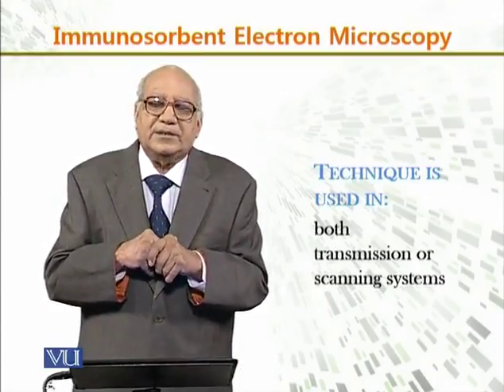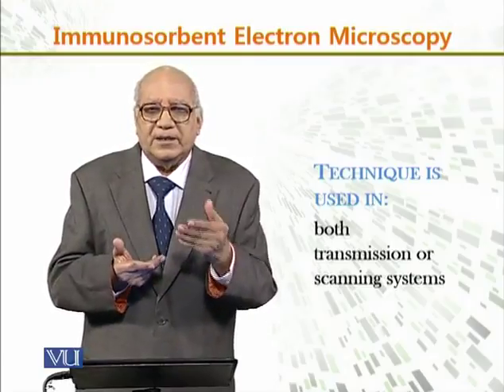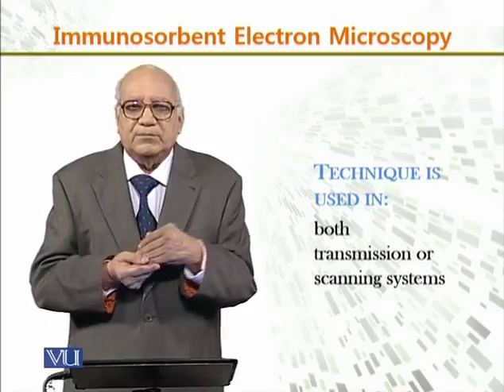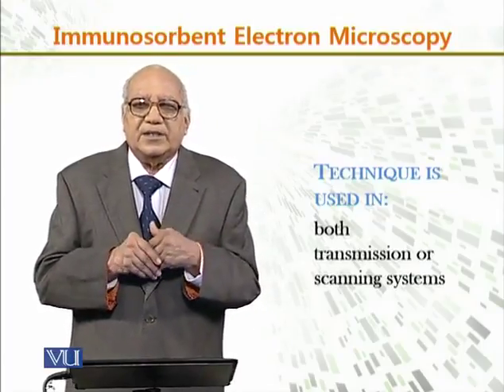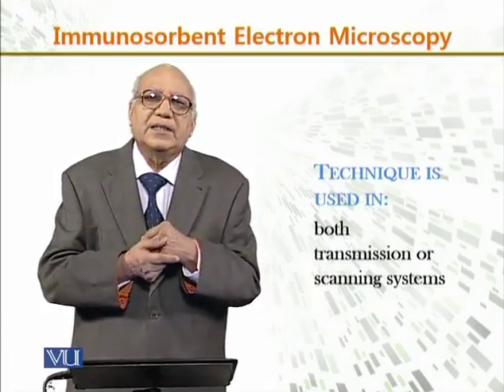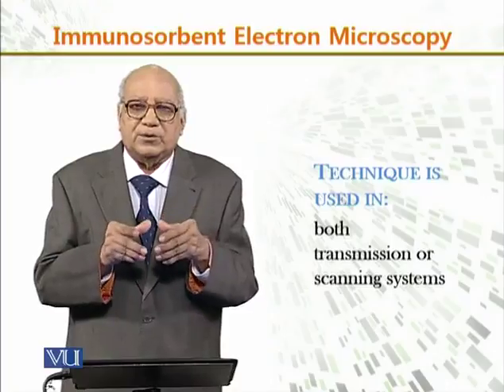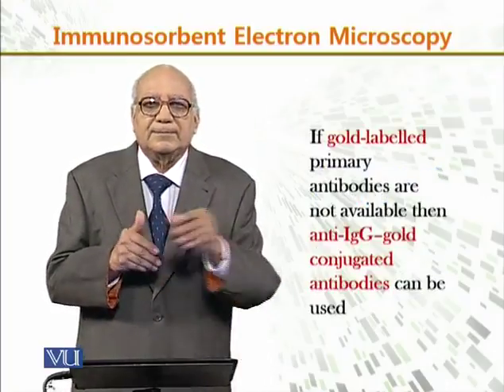Now, this technique is used in both transmission or scanning systems, that is, we can use it in a transmission electron microscope or in a scanning electron microscope. Both microscopes or both techniques can be used for this.